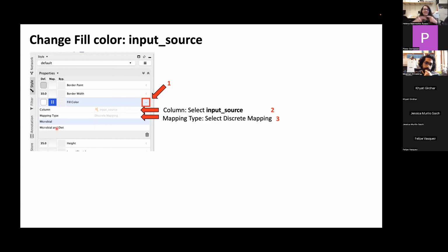Yeah, so later on, Peter will show very briefly what are the types, what are the fields of microbial information that we are going to be adding. And this source field is one of the fields that people have already deposited and that we can map here. I see. Thank you.